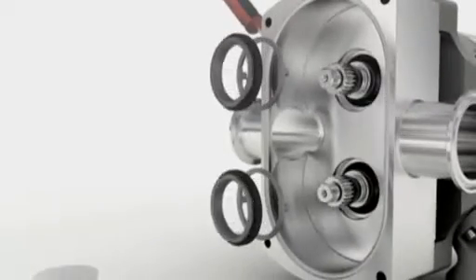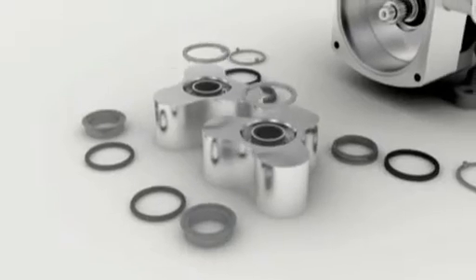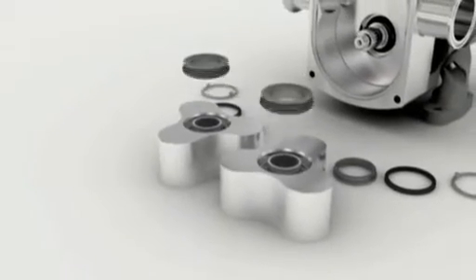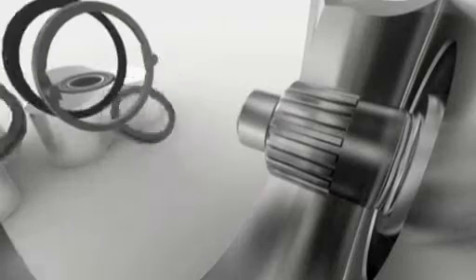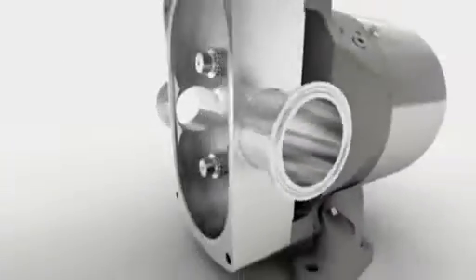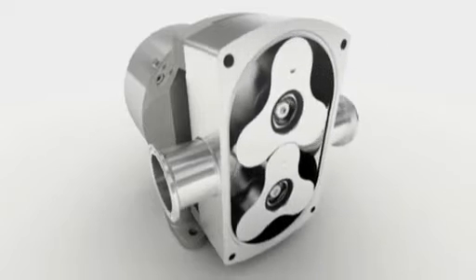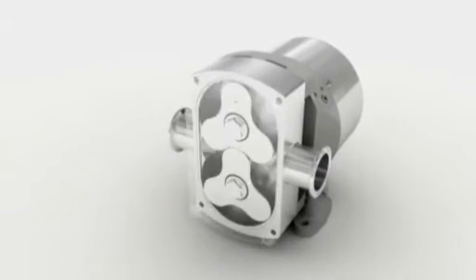The Optilobe features the easy-fit front-loading single and single flushed mechanical seals. This means that there is no need to remove the rotor case for repair or inspection. And because the seals are all self-setting, they are easy to fit and maintain, resulting in reduced overall maintenance costs.